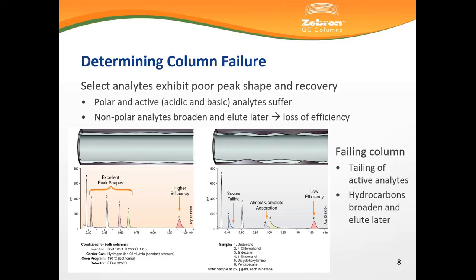If this column behavior continued after replacing the inlet liner and the septa, then we can begin to confidently determine that this column may have exceeded its lifetime. There are other considerations with respect to your method conditions, such as your sample preparation or the agreement between the polarity of your analytes, solvent, and stationary phase. At Phenomenex, we can help you to navigate those other considerations.